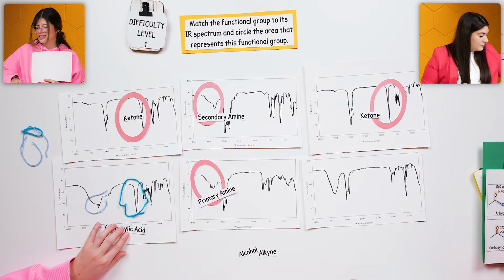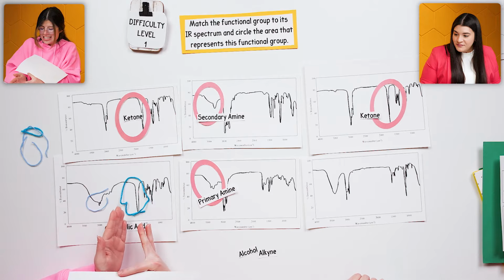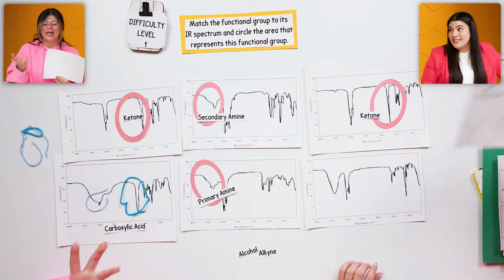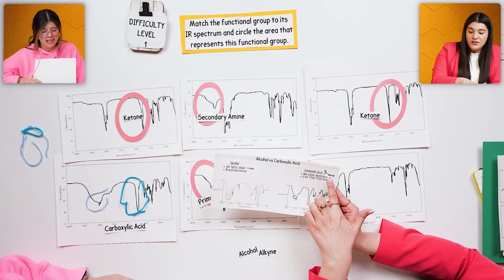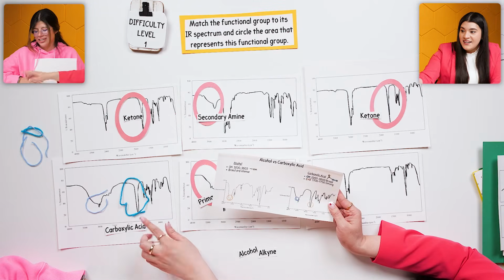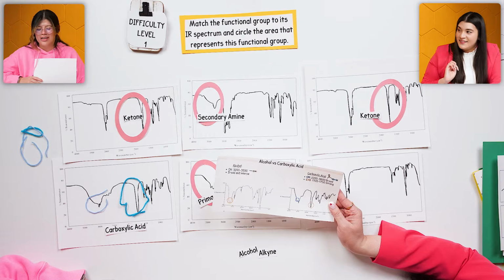That's making more sense, because I'd always split it up and look at this and then this, and it just didn't make sense, because I'd get it piece by piece. Together they form one thing. You're really just looking at: this is telling me the oxygen connected to the hydrogen, that's here. This is that carbonyl group, carbon double bonded to oxygen, and that's here. Then you piece them together and you know, okay, carboxylic acid. That makes so much more sense.